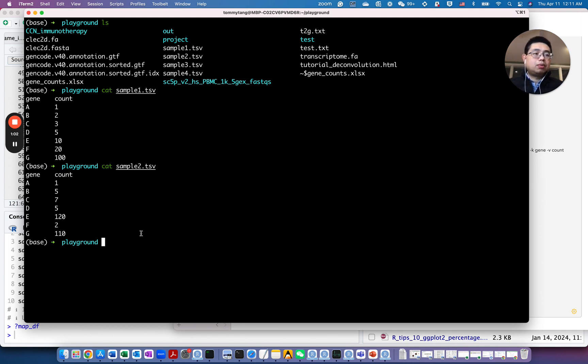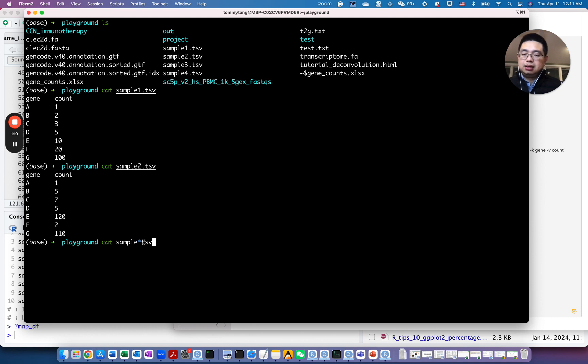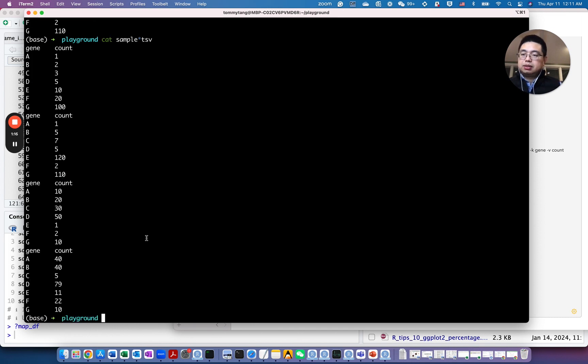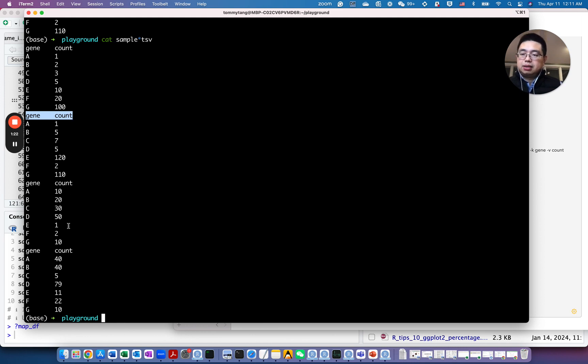So you might want to just use the cat command to concatenate all the files together. For example, you can use cat and then use the wildcard. So it will actually capture one, two, three, four. And if you do this, the problem here is you have the first problem is you have the header repeated in every file.